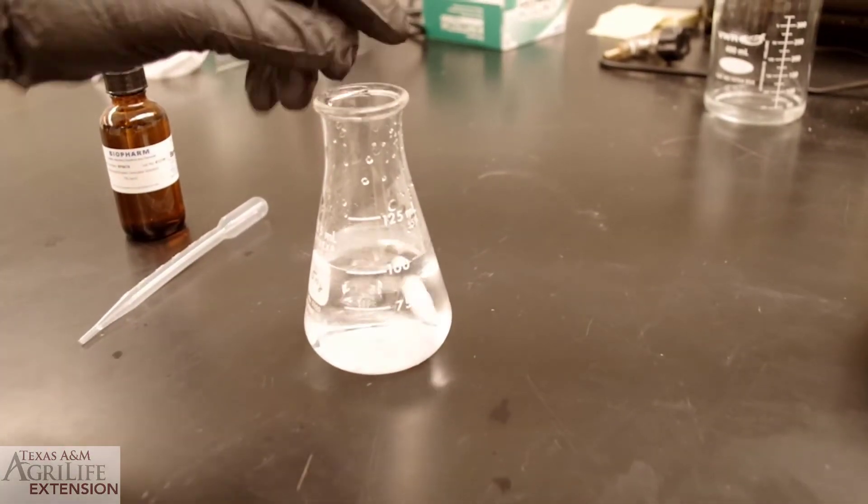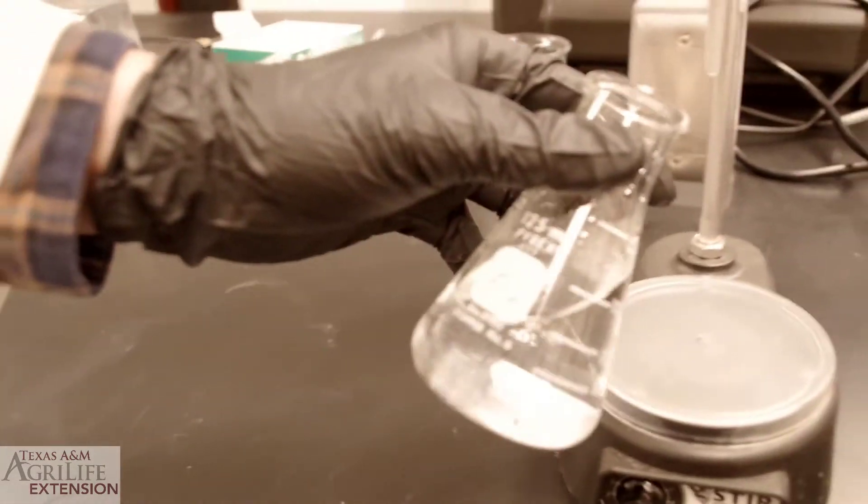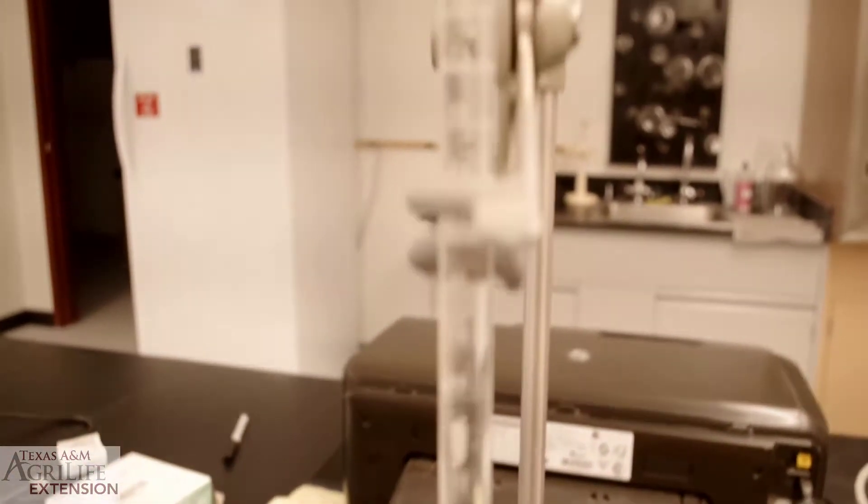We add a stir bar to our flask and place the sample on a stirring plate underneath our titration burette.